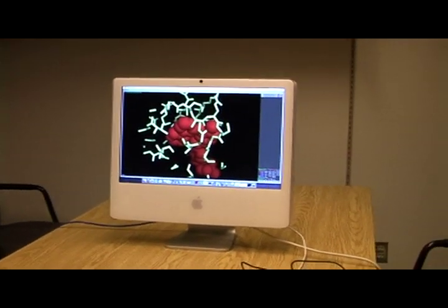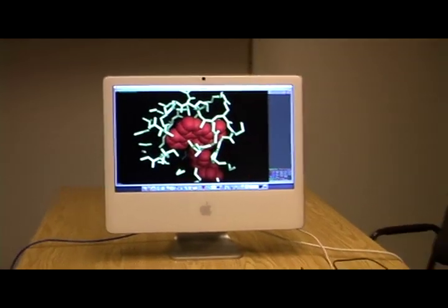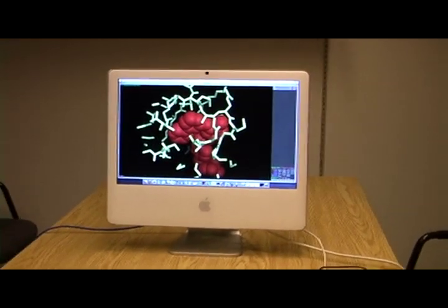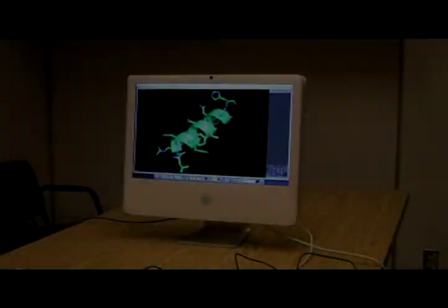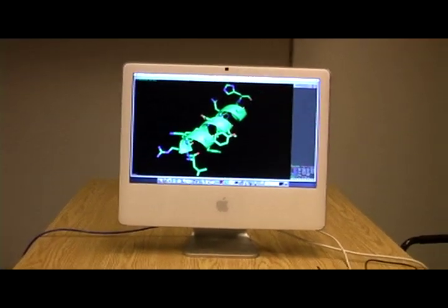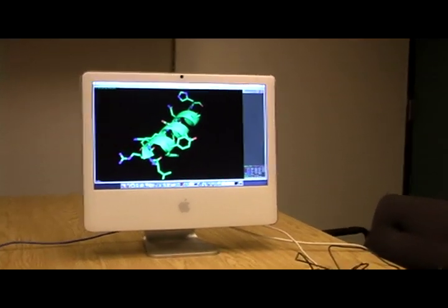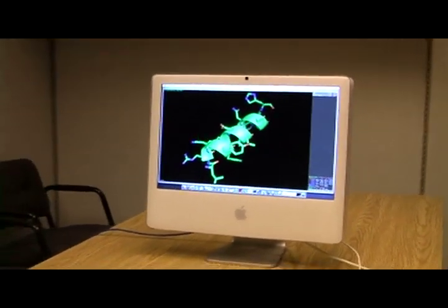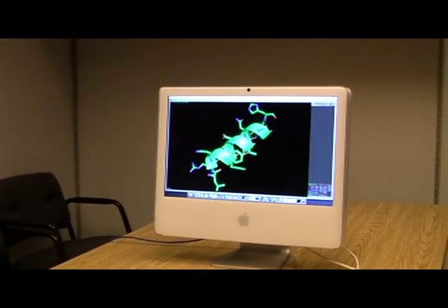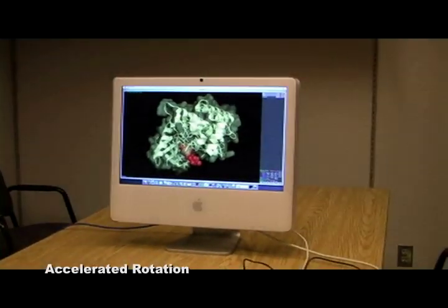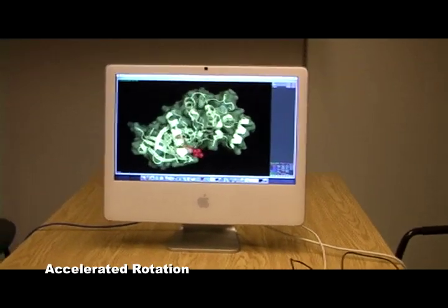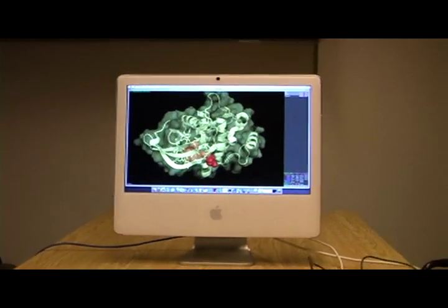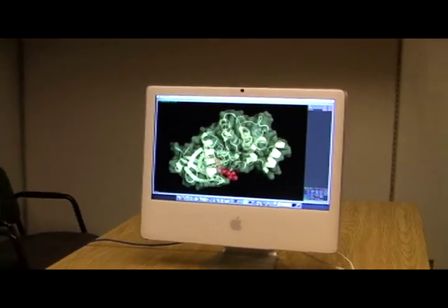We can also see what the drug complex looks like when controlled with head tracking. Keep in mind that no additional gear is used for this experiment — the only input is from the webcam built into the monitor itself. Again we see what the helix would look like, but this time without the aid of infrared sensors. One functional technique that was added was the use of accelerated rotation, which allows the user to see any angle of the molecule by moving only a limited amount of space to the left, right, up, or down.